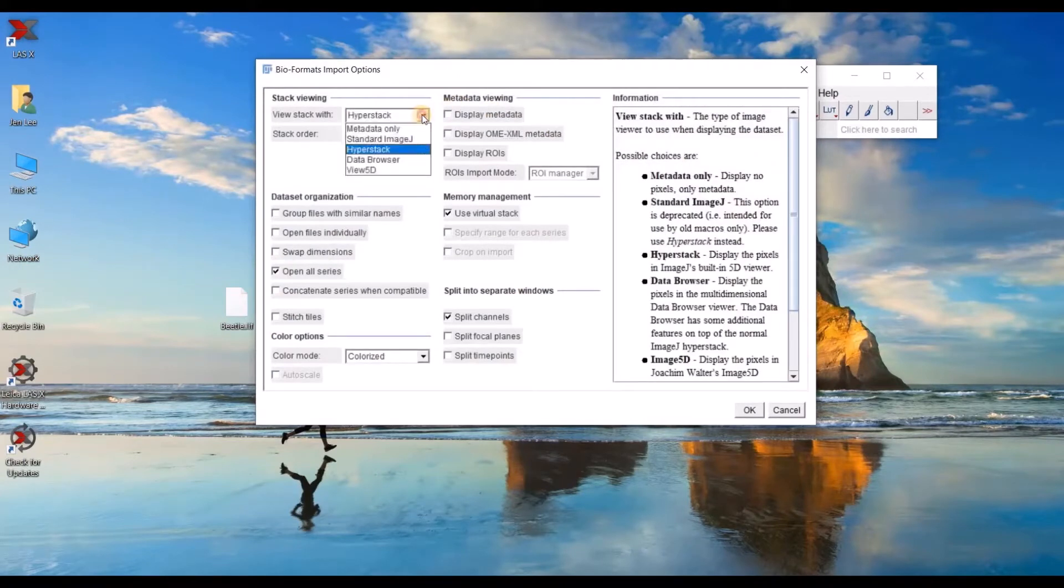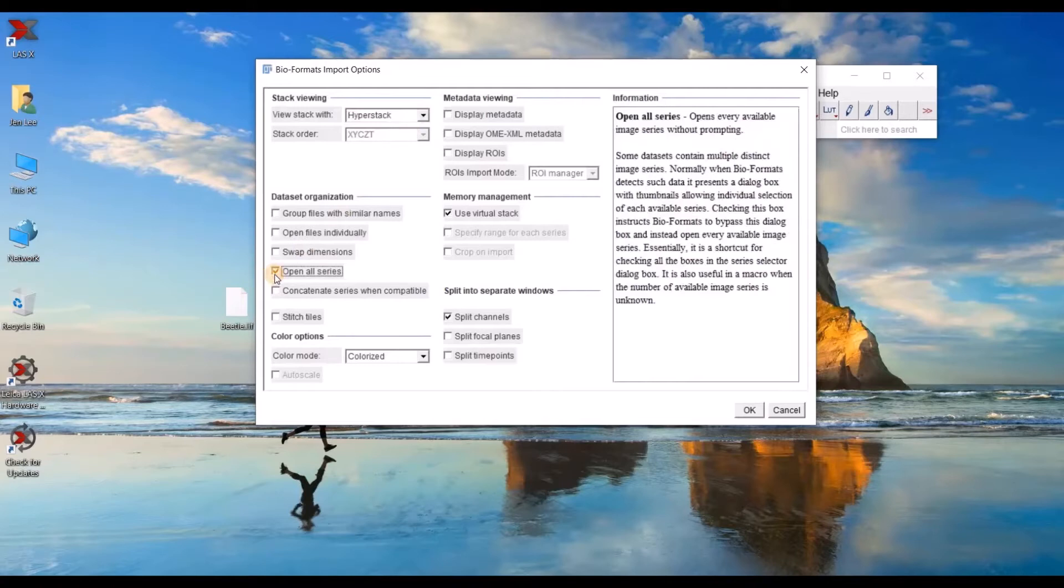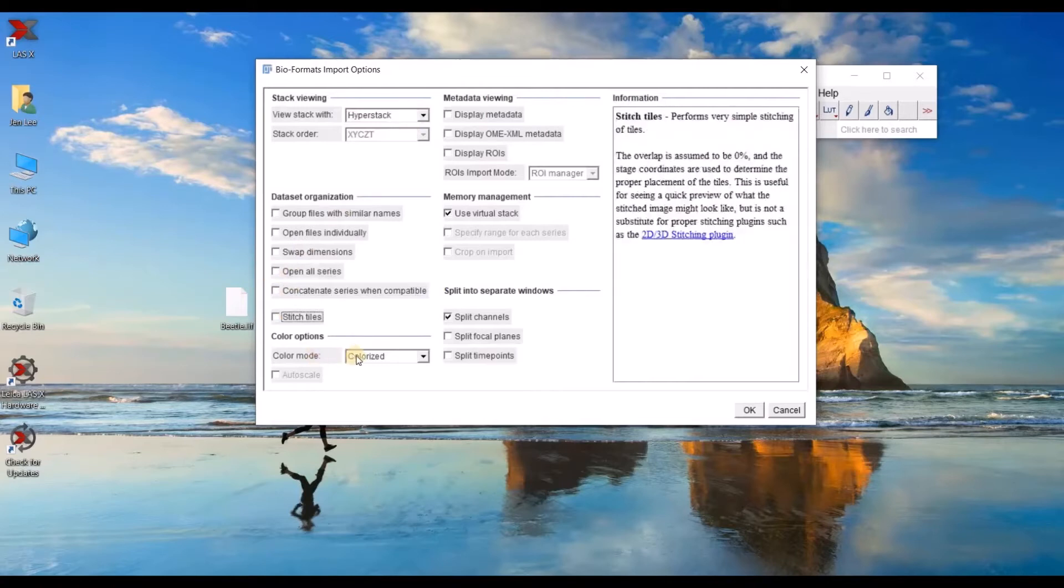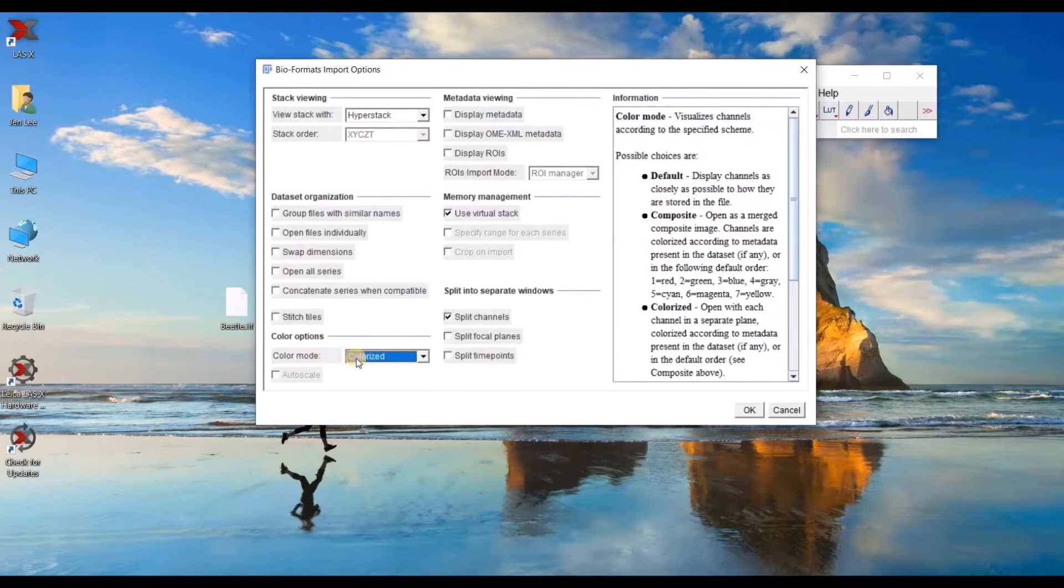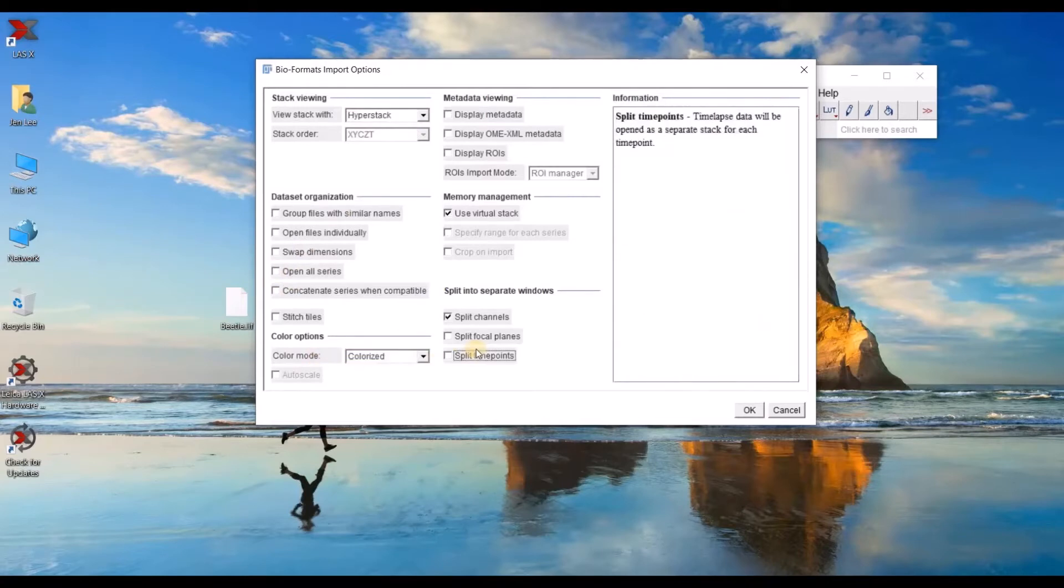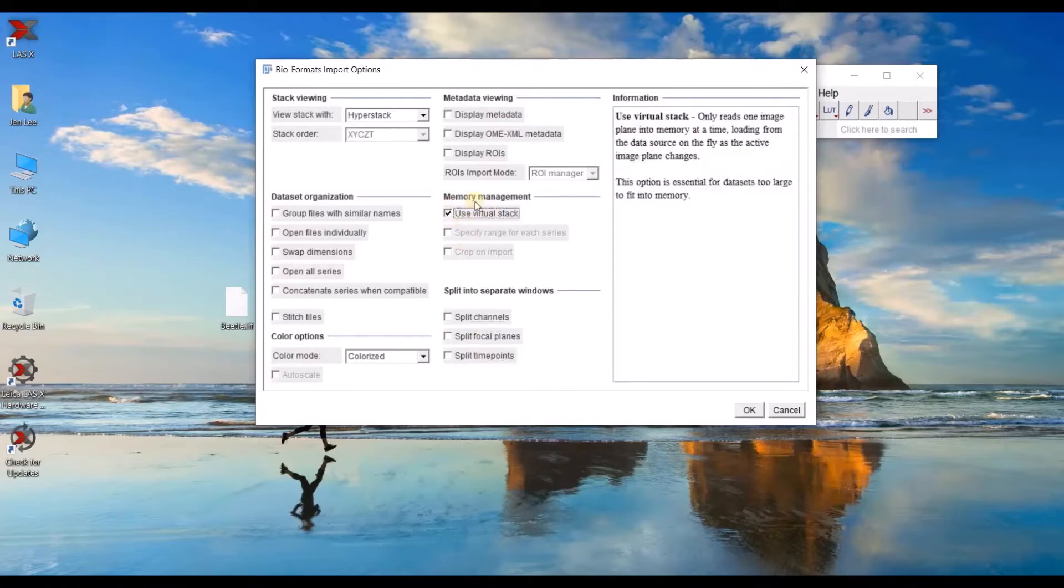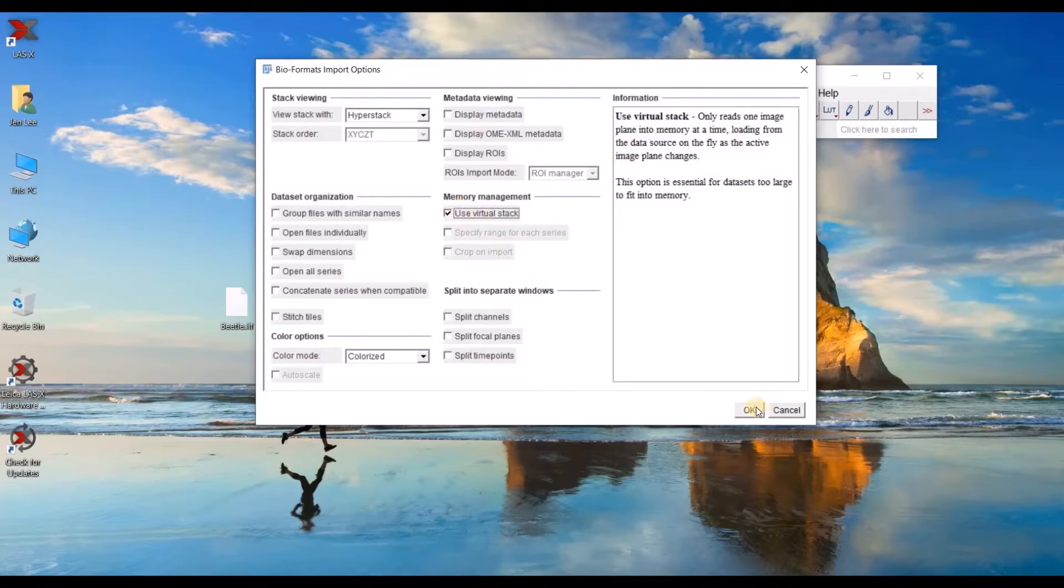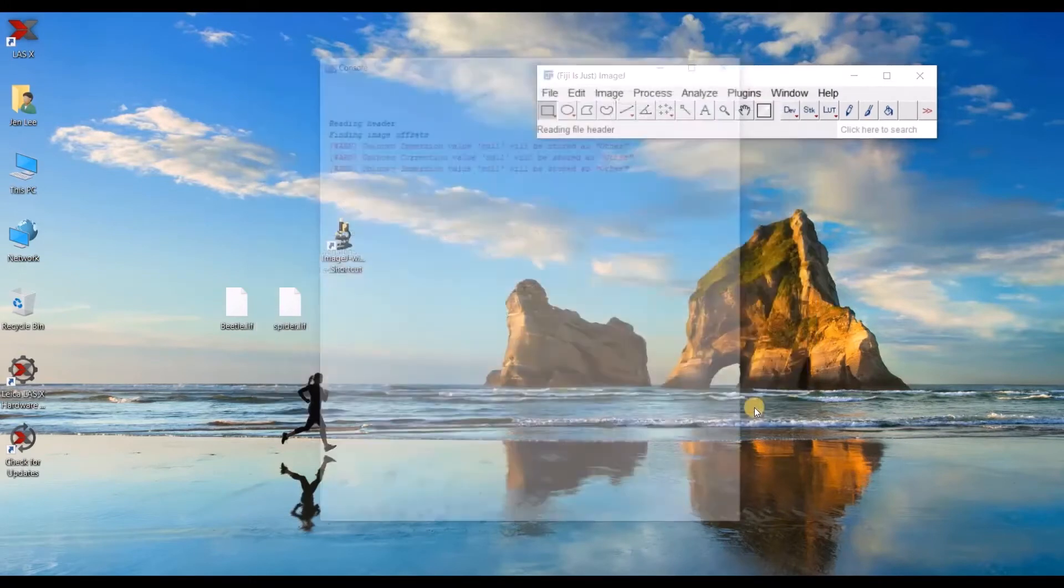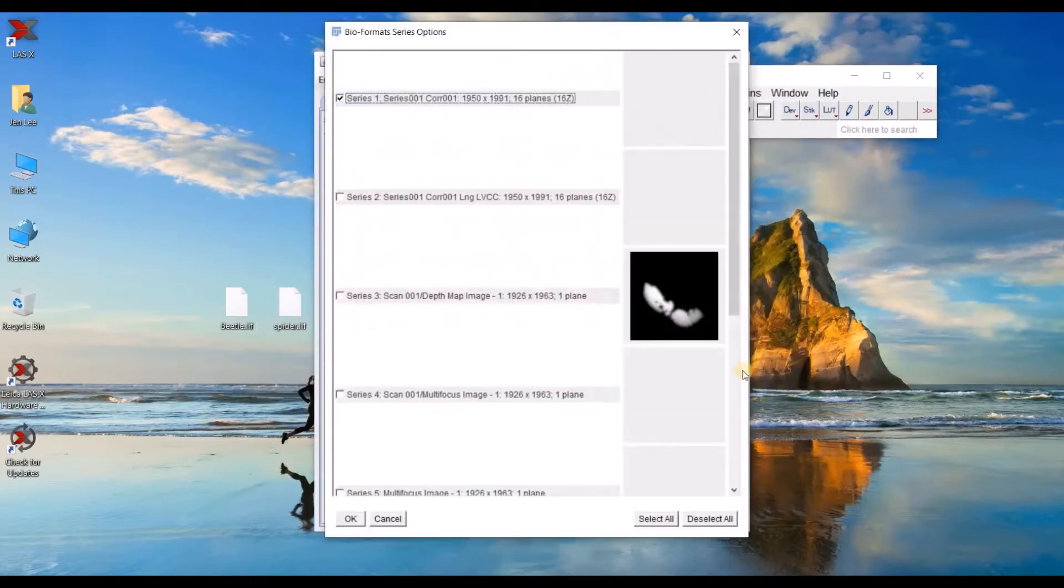You'll want to open your file as a hyperstack. There is an option to open all series. You can change your color mode. You can split the channels if you want to. And the virtual stack option is a really good option for very large files so that it will use less memory. Go ahead and press OK.